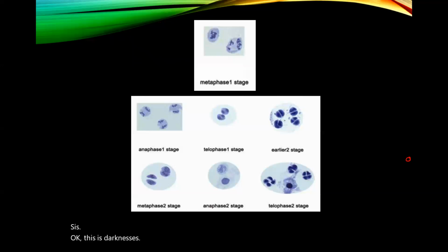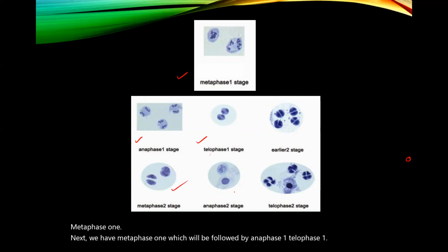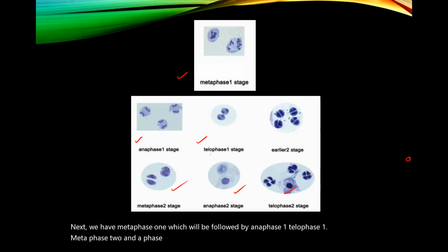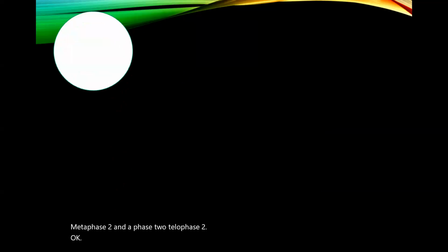Next, we move on to Metaphase one, which will be followed by Anaphase one, Telophase one, Metaphase two, Anaphase two, Telophase two. So here we come to Metaphase one.